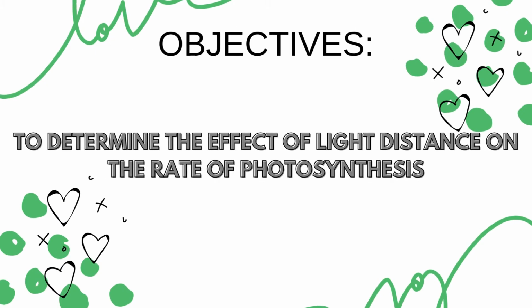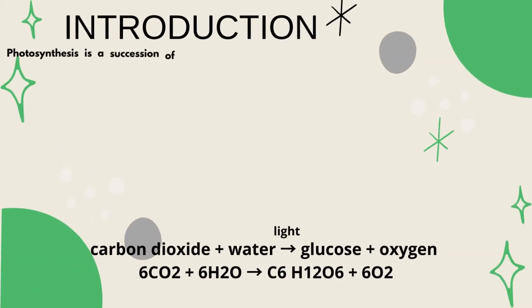Objective: to determine the effect of light distance on the rate of photosynthesis. Introduction.